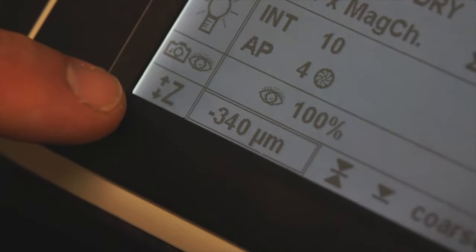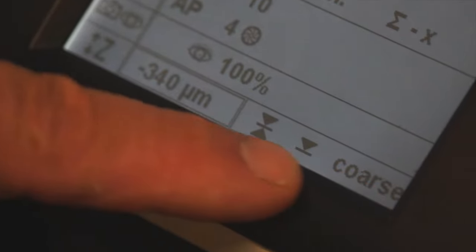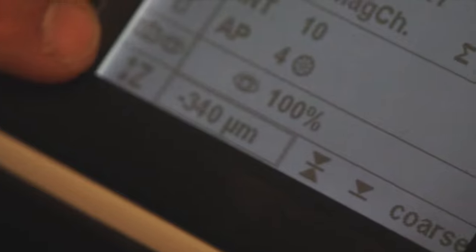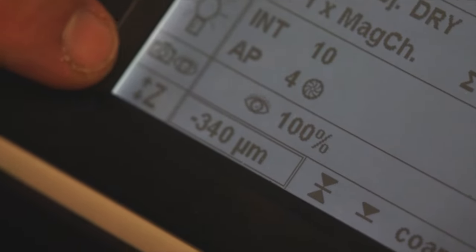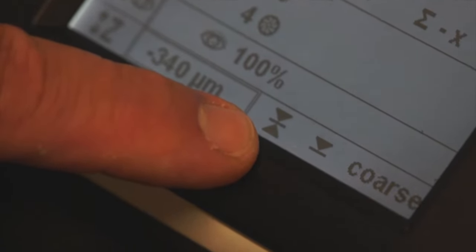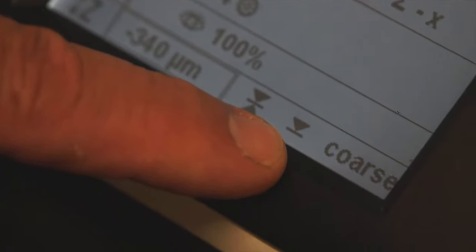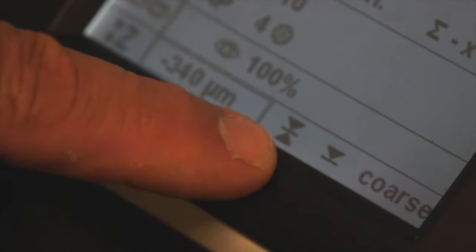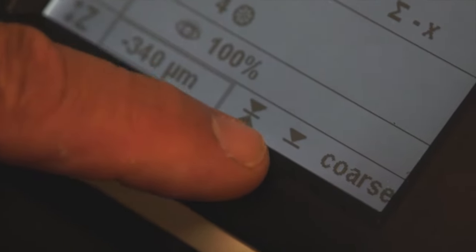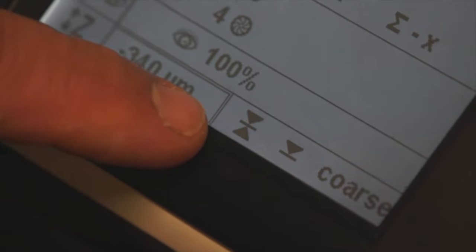When the microscope is first initialized, it is important to look at this very bottom line of the text on the LCD screen. This line describes the Z position, or the vertical travel on the nose piece. You should be able to see two distinct straight lines, one between these two arrows and one below this arrow. This means, of course, that the Z-axis has been properly set. If you do not see those two straight lines, go get the confocal microscopy technician and have him correct this parameter.